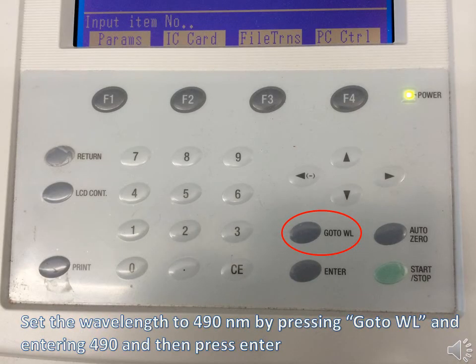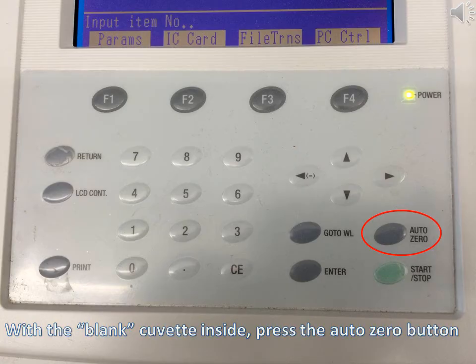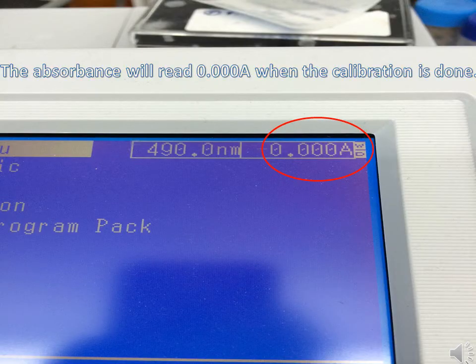Set the wavelength to 490 nanometers by pressing the 'go to wavelength' button and entering 490. Before reading the absorbance of your samples, you need to create a blank. Fill the cuvette with one milliliter of DI water and place it into the housing with the arrow or ribbed side of the cuvette facing you. With the blank cuvette inside, press the auto zero button. The machine will be properly calibrated if the absorbance reads zero with the blank inside.